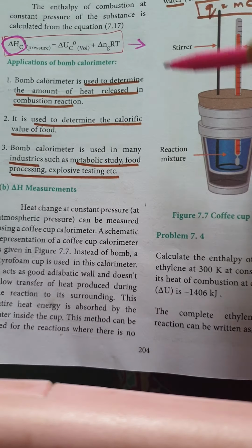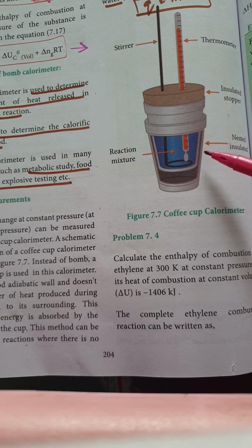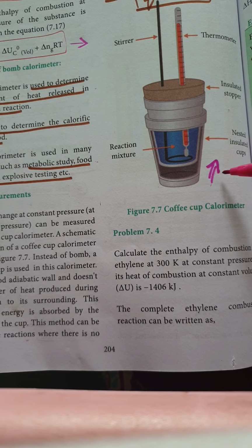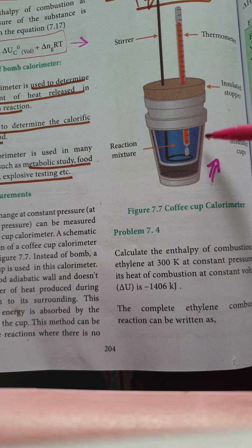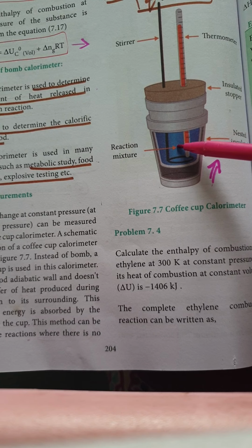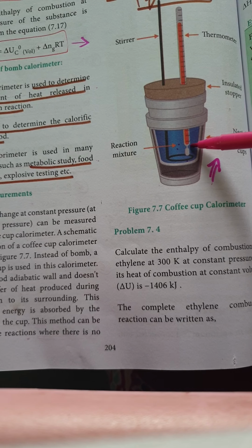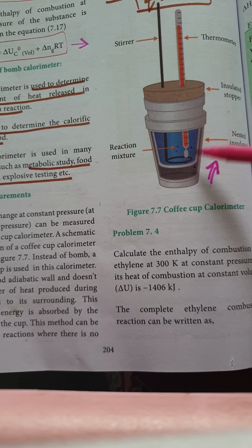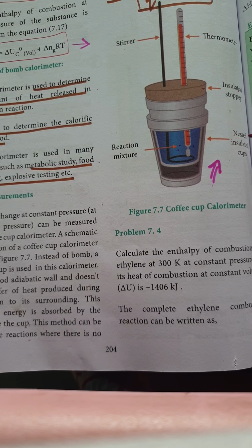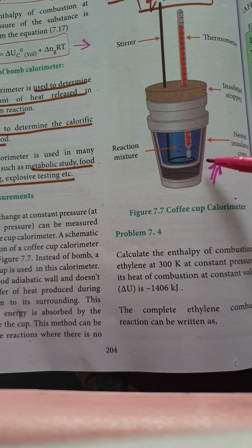Now the applications of a bomb calorimeter are given to you here. Now this is a small sample, which you can perform even in your houses using a coffee cup. An ideal closed system is here. Inside you have a sample, the reaction mixture, which can be stirred using a stirrer, and the initial and final temperatures can be measured using a thermometer. And this is an insulated stopper which does not allow heat to go inside or come outside. This is a nested insulated cup. So this is a small example of an arrangement of a calorimeter.